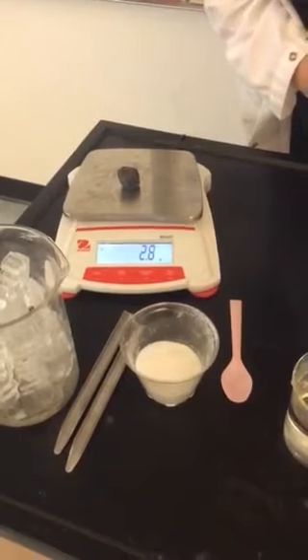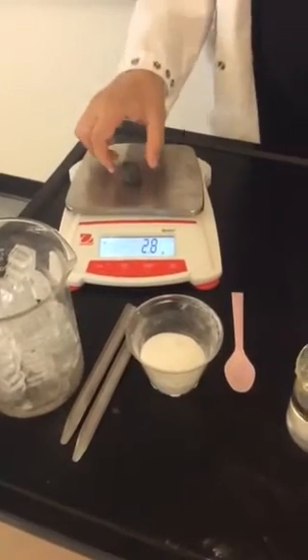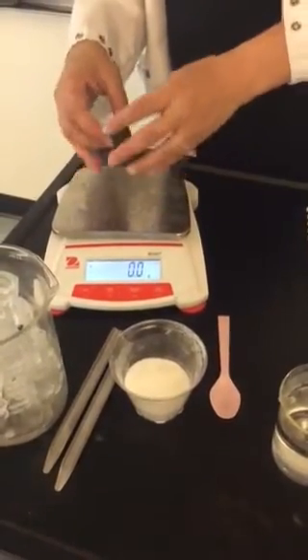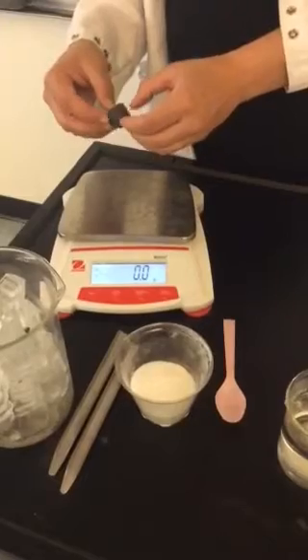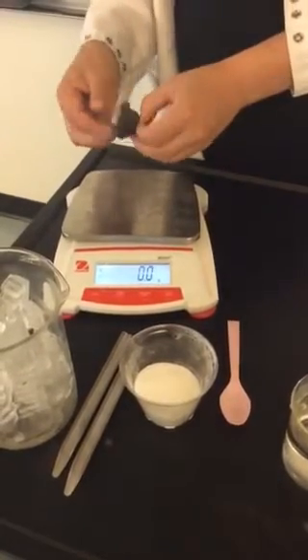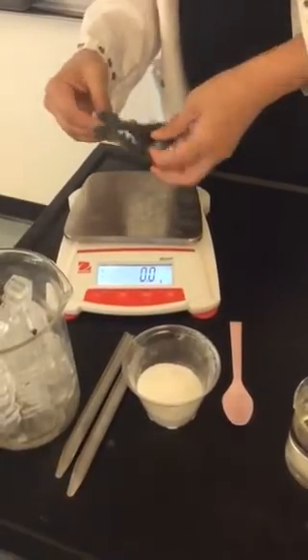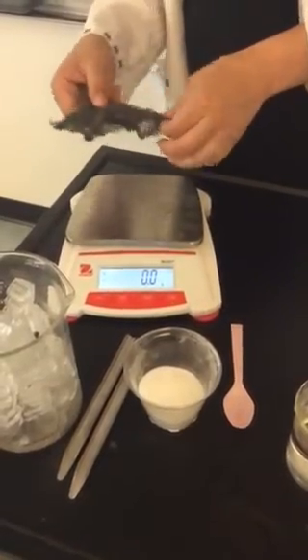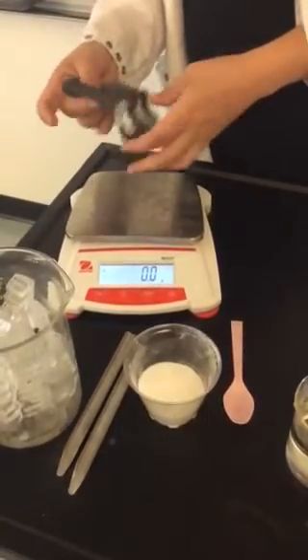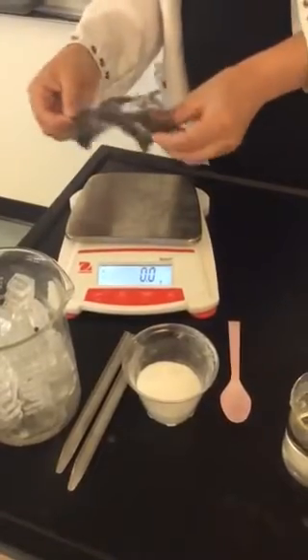I am finding a mass of 2.8 grams. I'll remove the steel wool from the scale, and I'm actually going to pull it apart on top of the scale in case any pieces start to fall off as I'm pulling it apart. But now I will pull apart the steel wool, make it super stretched out, taking up more space, stringy.